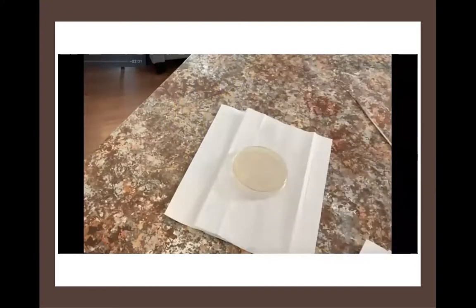Oh, I've mentioned before that we handle agar plates upside down. We put agar plates into the incubator to allow bacterial cells to grow upside down. In other words, we want the agar, that solid media, to be at the very top once it's upside down.